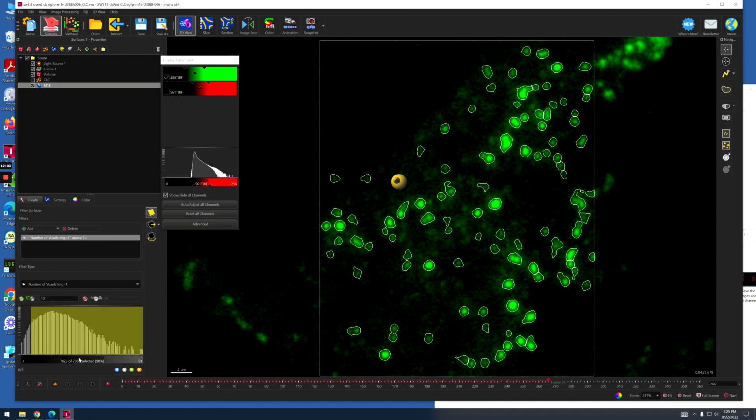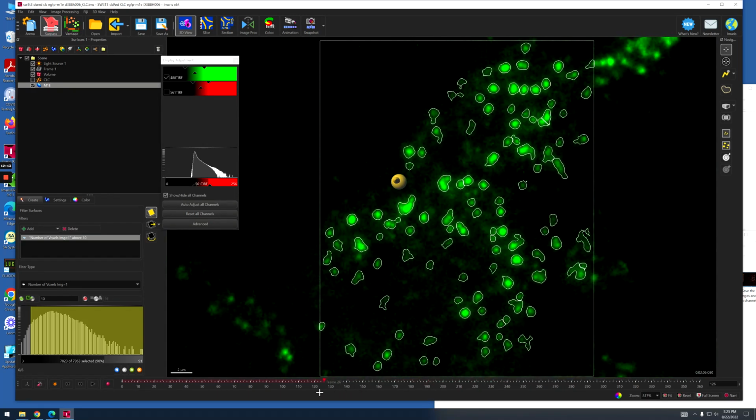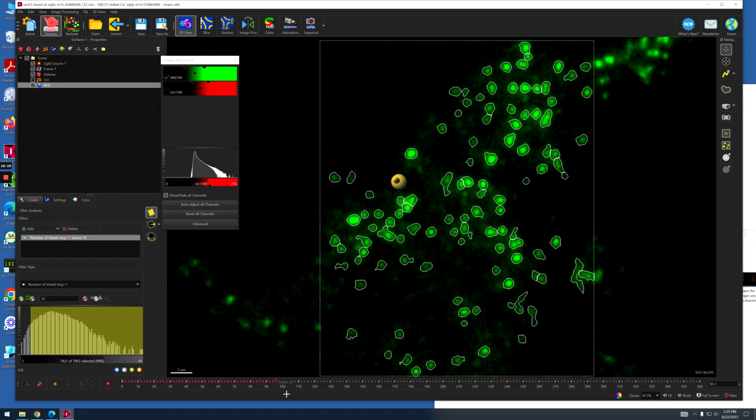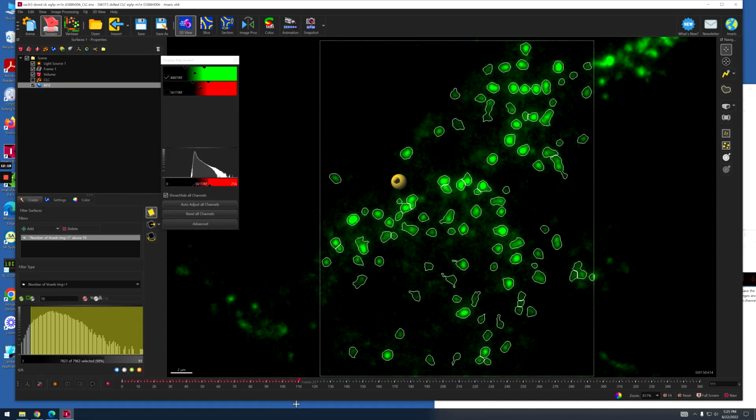Okay, now it's done. Basically I think my selection, my filter from before looks pretty good. I got basically everything I want, and the vessel size looks good so far.